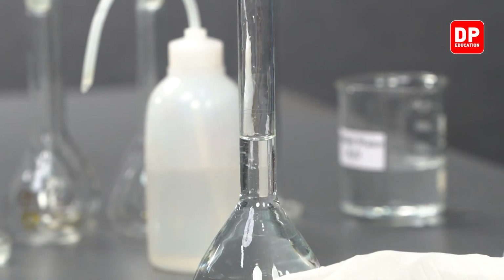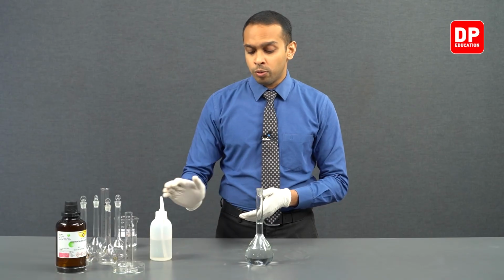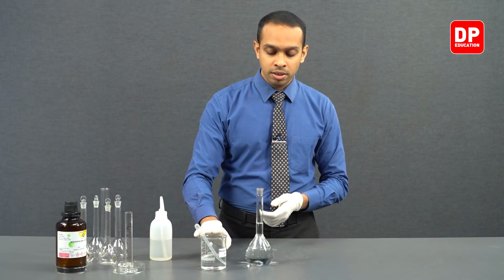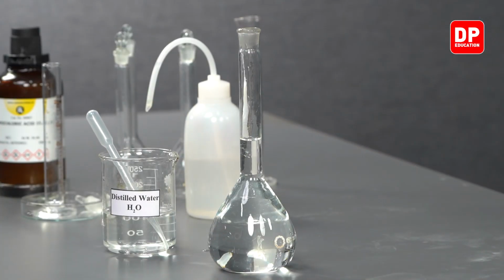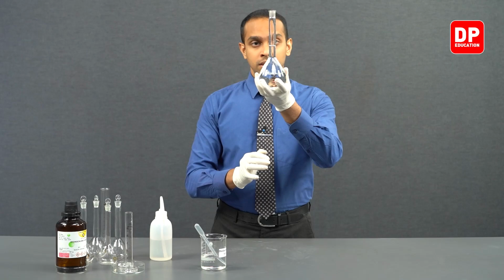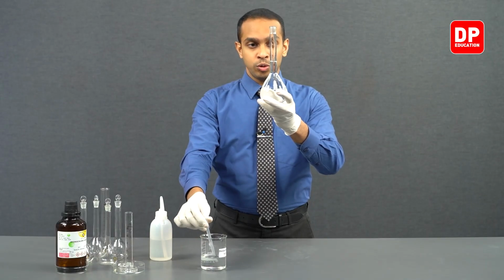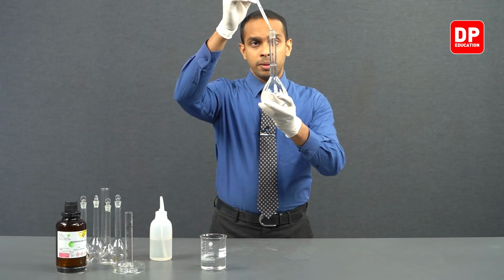After you come quite close to the calibration mark, please be careful when adding water with the help of a wash bottle. Instead, you can use a dropper and a little bit of distilled water, and you can bring your eye level to the calibration mark, or you can lift this volumetric flask all the way up to your eye level so that the calibration mark is at your eye level. While holding it like this, you can proceed to add water with the help of a dropper.